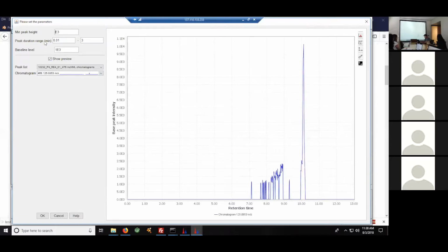So if I would lower this now to 2, you can see, okay, then the end of this hump is considered. But as you can see before, the baseline just had a spike and dropped below the threshold, which probably was not a real different peak, just an interruption of the signal. So that would fall off. But overall, I think it looks okay.